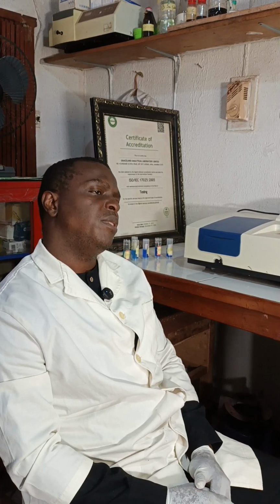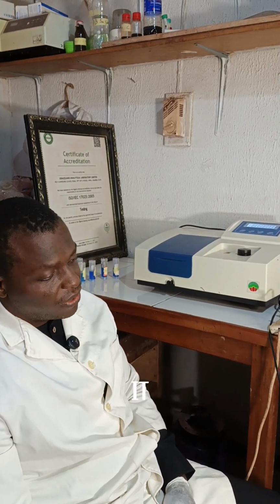Now, UV visible spectrophotometer finds application in water analysis. It can be used in determination of inorganic anions like nitrates, nitrites, phosphates, and so many others. You can as well find analysis in the textile industry, where it can be used to analyze dyes. It can be used in the pharmaceutical industry, in the food industry, and as many industries that it finds applications in.